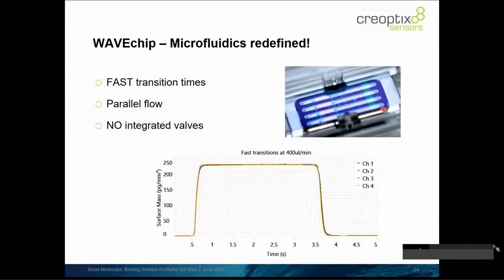The wave chip is seen here in this photograph, which is a close-up of the four channels. We're looking at a four-channel parallel channel microfluidic flow system.